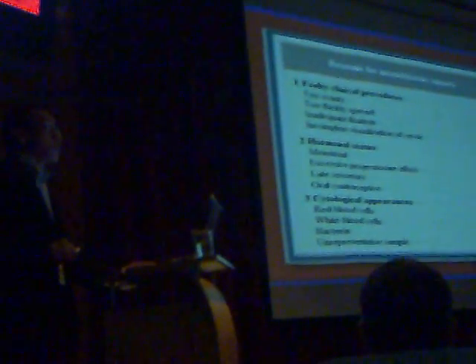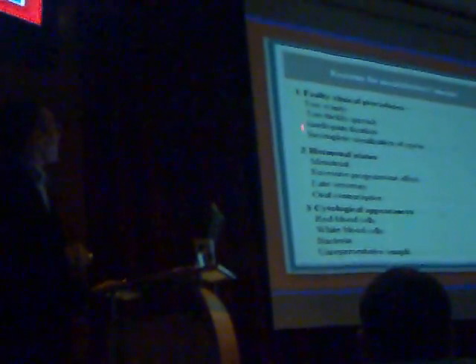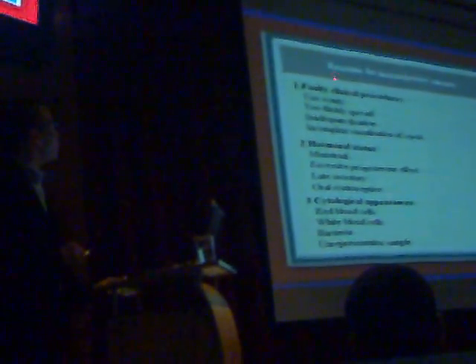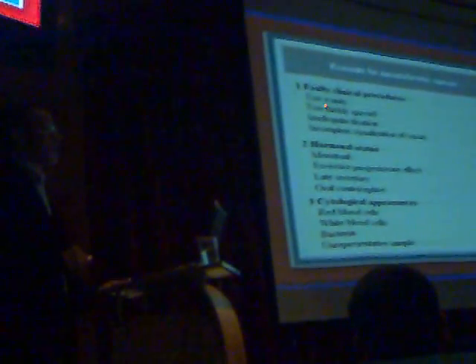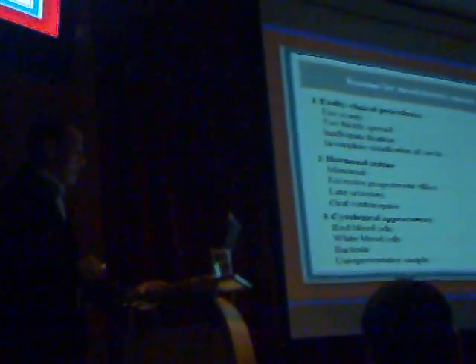I need to say that these are the causes of unsatisfactory traditional pap smears. If we look here, everyone asks himself, can I reduce the rate of unsatisfactory smears? Of course, everyone can do it. Yes, I can, by proper technique.